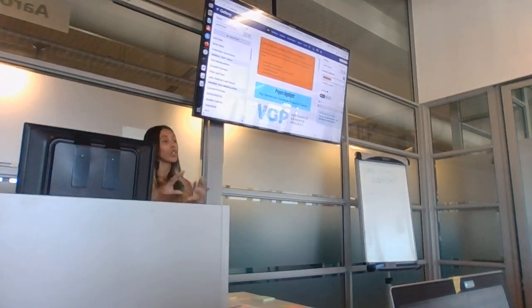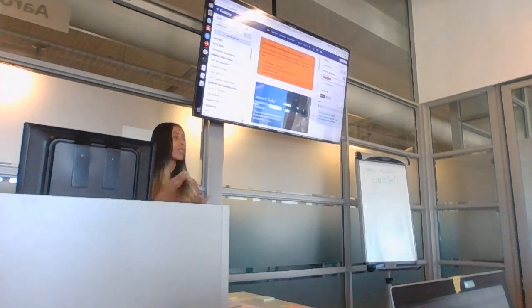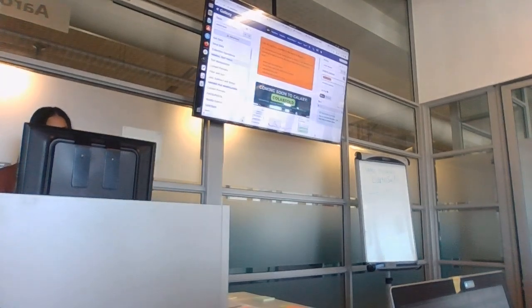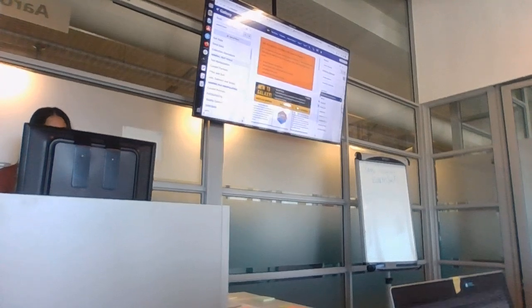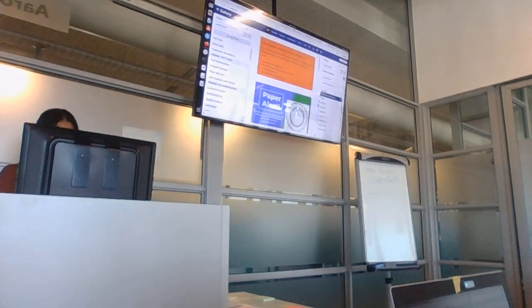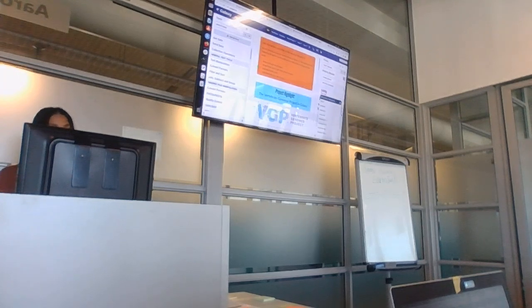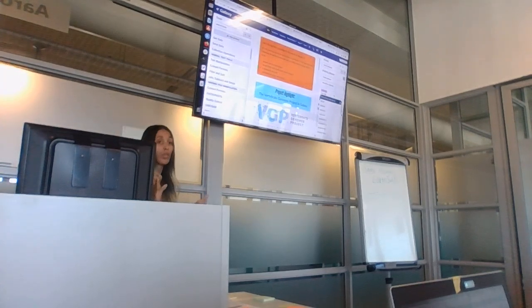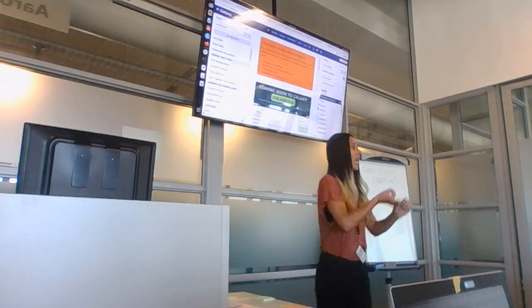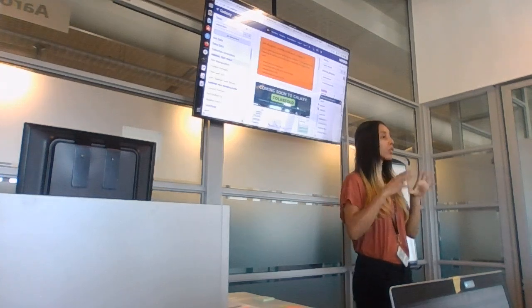You would have them in the same history, but you can use a tagging system. If you look at this button over here, it says tag. So you can actually add a tag to your data set. So let's say these are the treated samples. You could write treated, and you could tag this as treated, and you can use multiple tags if you wanted to. So if this is treated cholera from Zambia, you could use multiple tags to distinguish it from here.